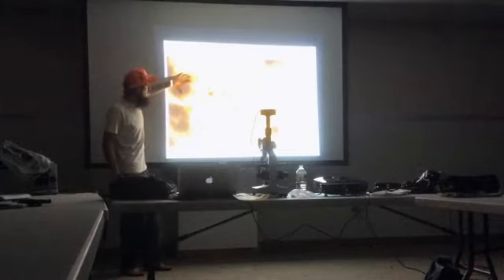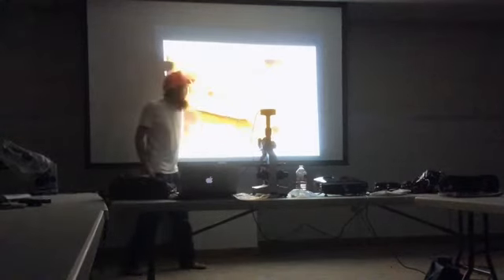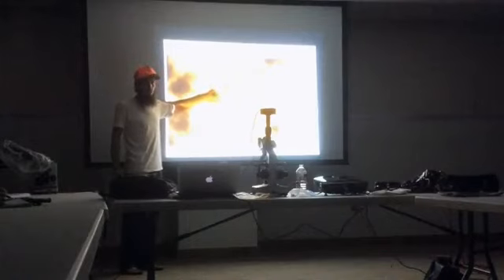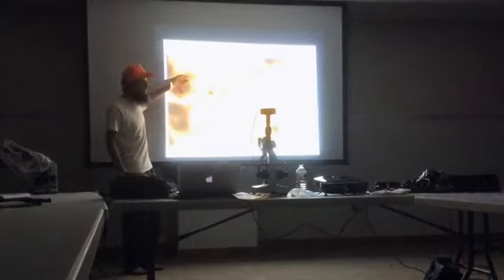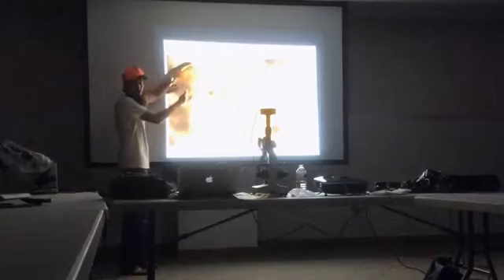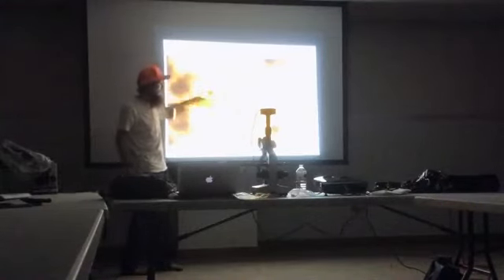These big clumps out here, when you're looking at this sample, you would call this an aggregate. When something is stuck and clumped together like this, it's an aggregate. So this is just a bunch of bacteria glued together on some particles of dirt and some other minerals and things in the soil.